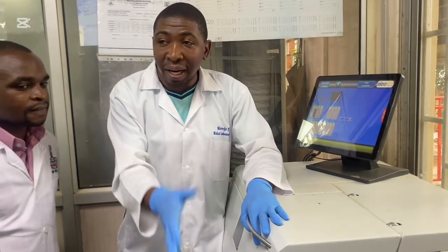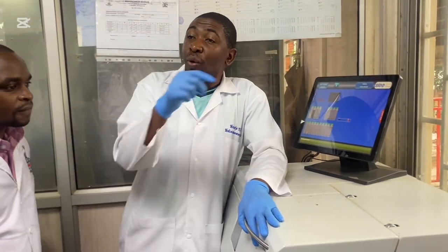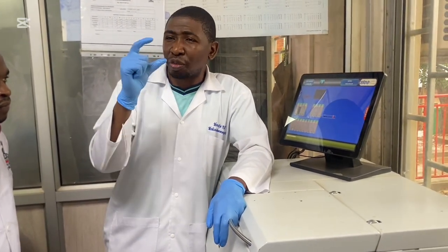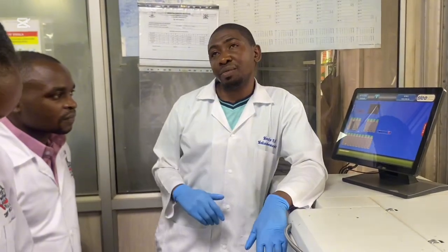However, it can be applied on all steps. But why is it mostly applicable on infiltration? It's because paraffin wax is viscous, so the rate of penetration will be slow. To enhance it, we apply a vacuum system.